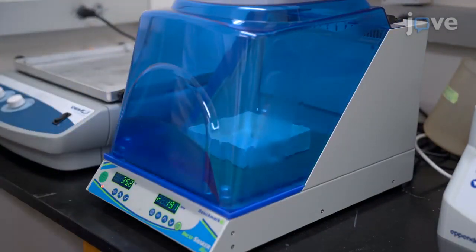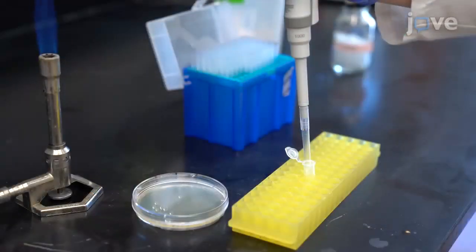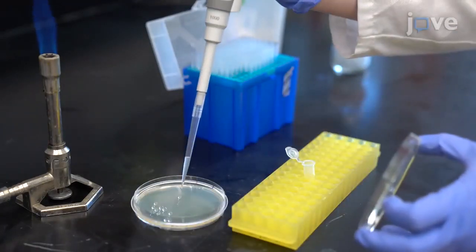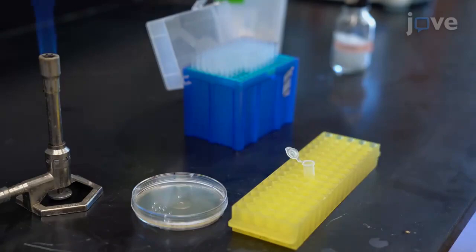At the end of the incubation, add approximately 10 autoclaved glass beads and 100 microliters of cells to a 37 degrees Celsius warmed lysogeny broth agar plate with the appropriate antibiotics and shake the plate horizontally.